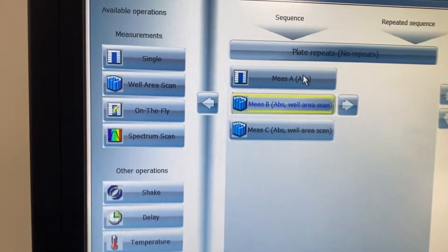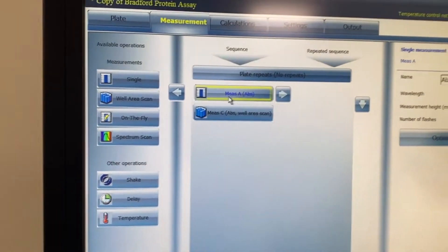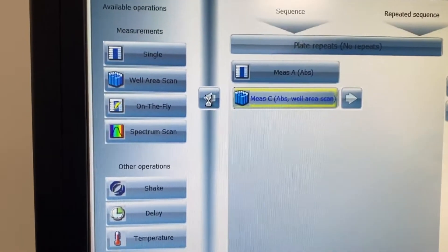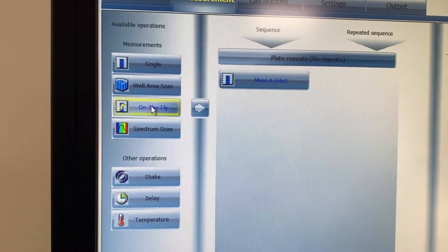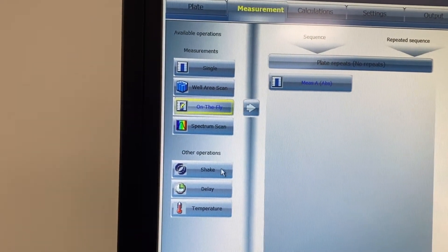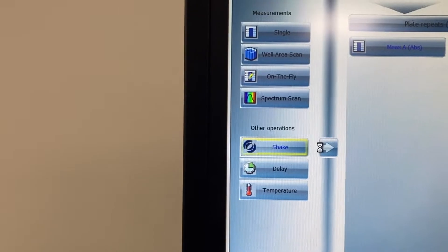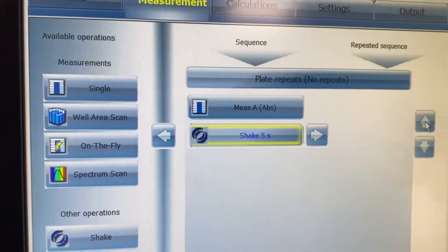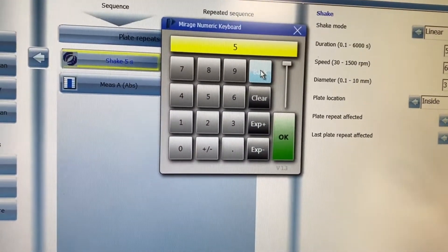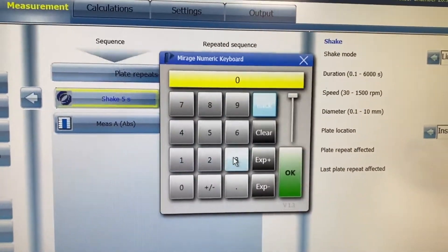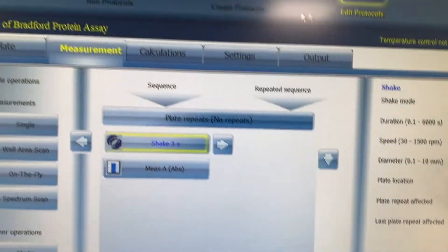So now you can see it's got absorbance and a well scan — but if you don't want it, you can just get rid of it. If it's not a single measurement, you can pick whatever measurement type you need, maybe a spectrum scan on the fly. To accept, just press the arrow. You can also add other components: a delay, a temperature requirement, or a shake. If I want it to shake just before it reads, I can bring that in, move it up before the read, and specify how long — say three seconds — and then it reads.